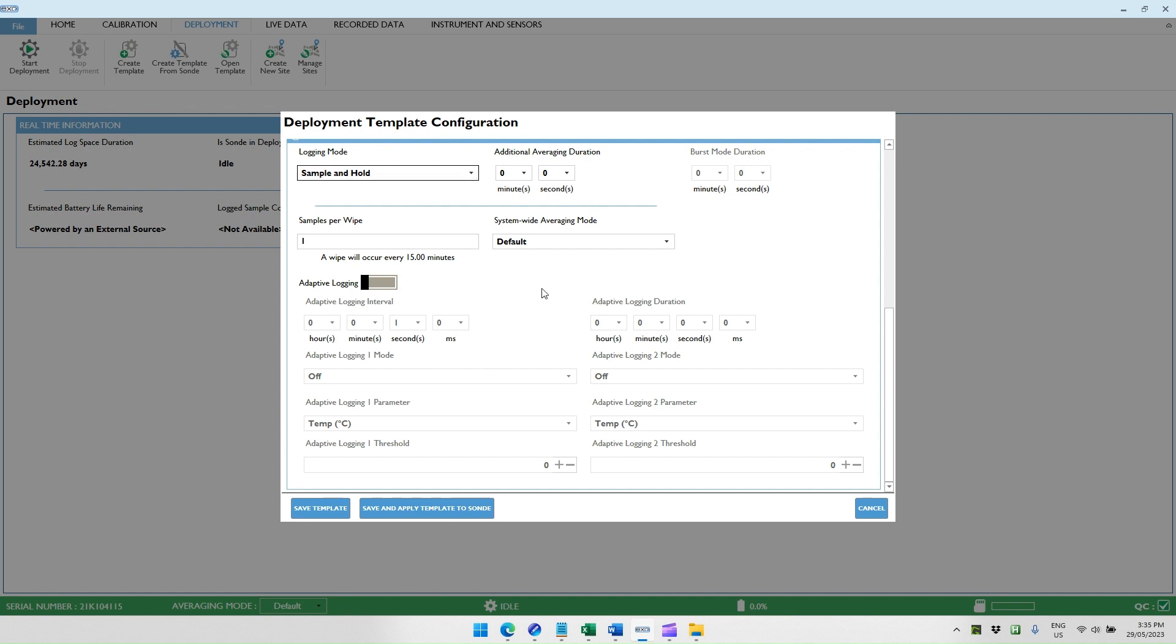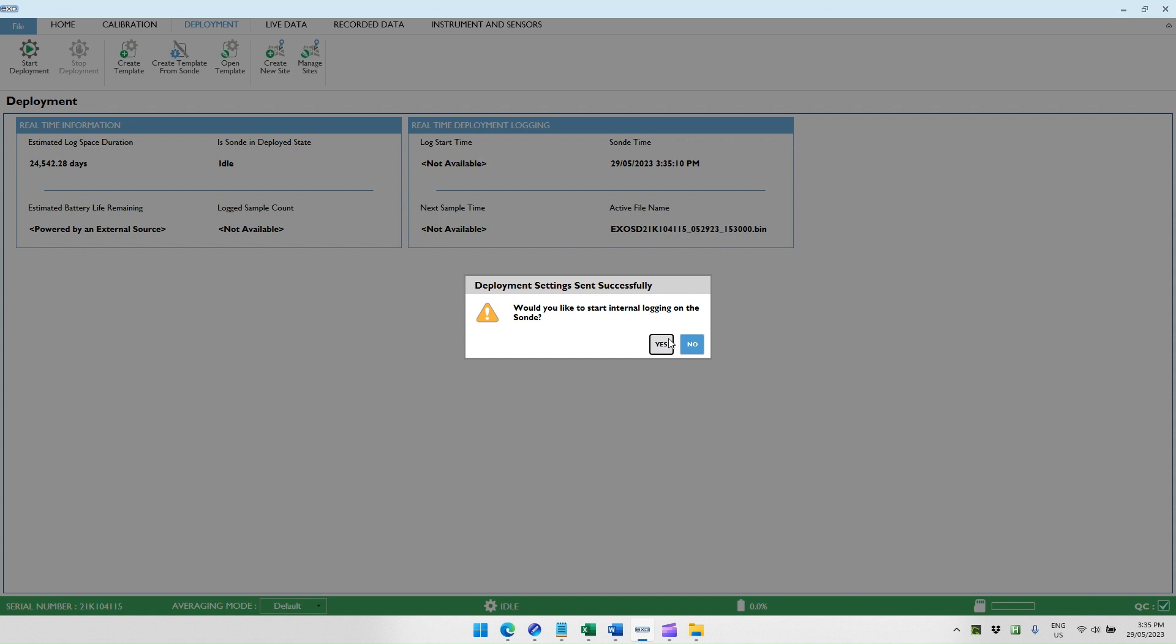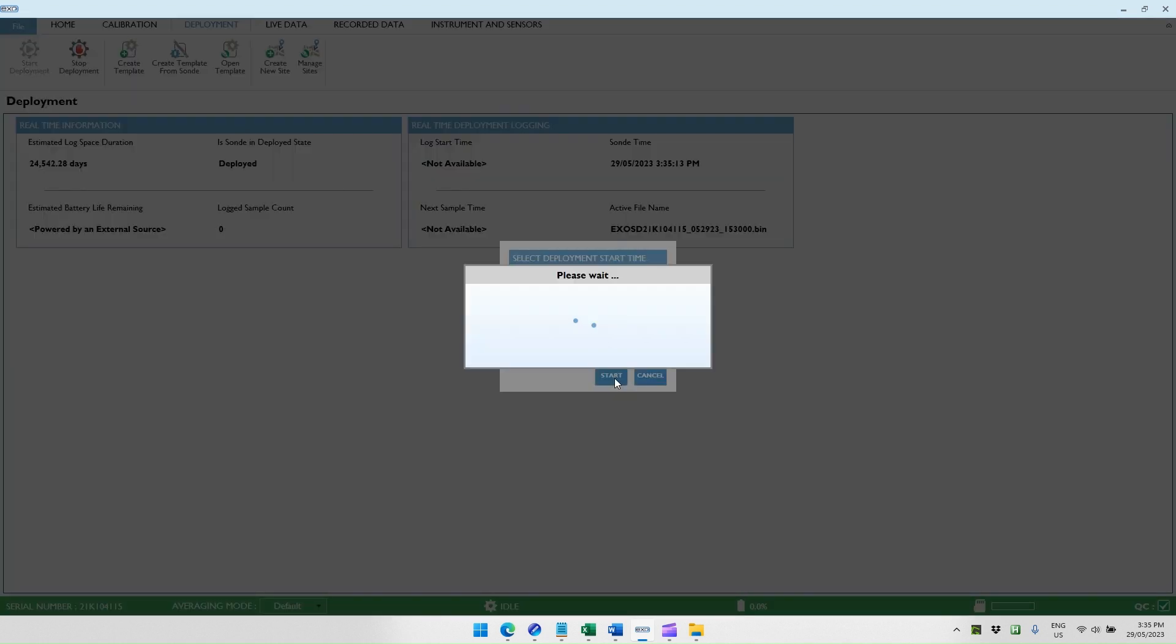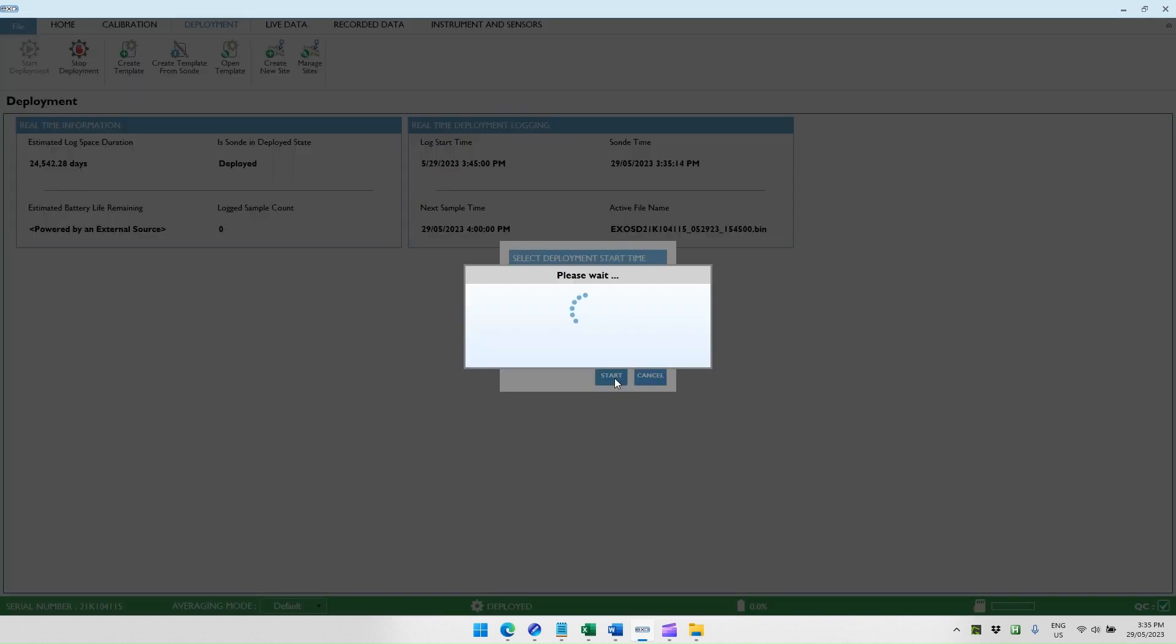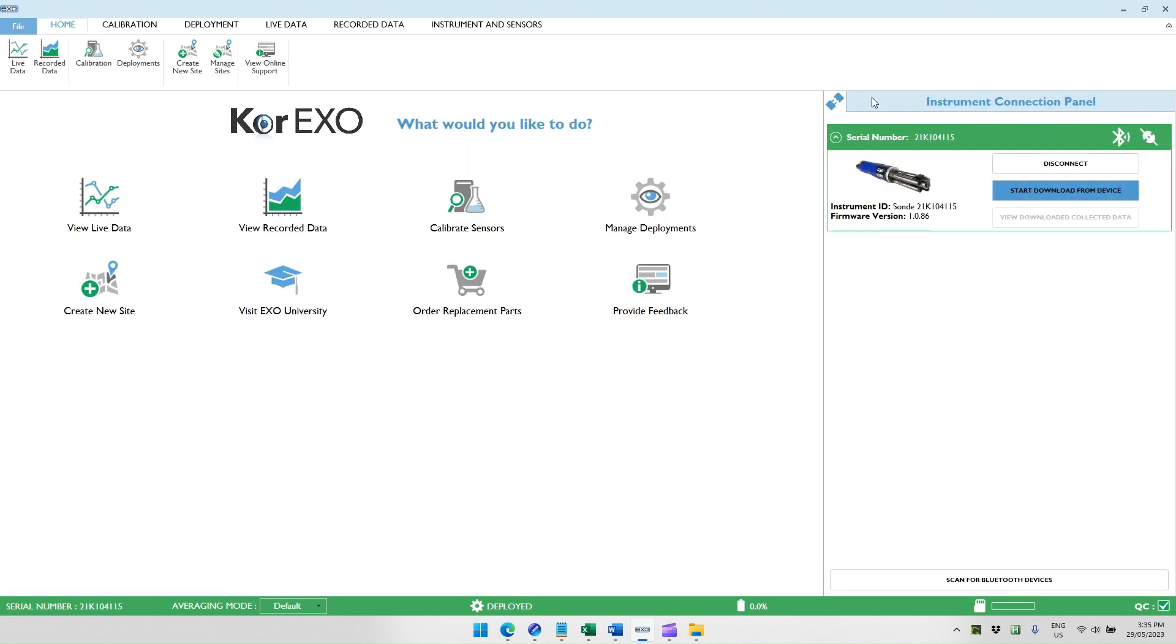Once you've set up these parameters, you can save and apply the template to the sonde and then start internal logging at the next available interval. We can then disconnect from the sonde and continue in setting up the buoy.